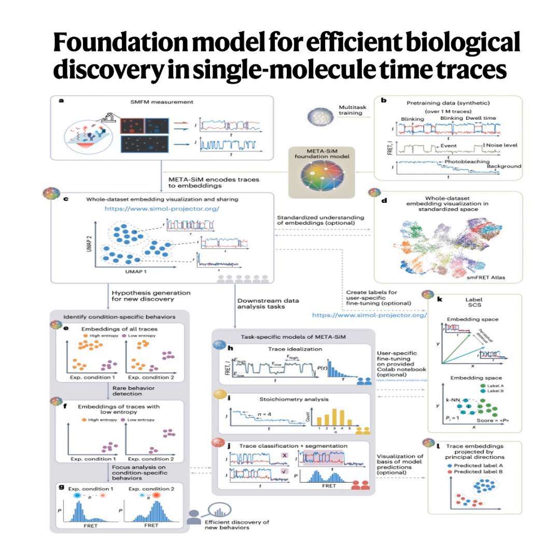They take that complex fingerprint vector for each trace and place it as a single point in a simple 2D or 3D scatter plot, like a cloud of points. Okay, so every single molecule's time trace becomes one dot on my screen. Precisely. And the key is that the way these algorithms place the dots isn't random. Traces with similar embedding vectors, meaning the molecules behave similarly, end up close together in this 2D or 3D space. So clusters of dots mean groups of molecules that had similar dynamics, maybe similar FRET states, similar dwell times.